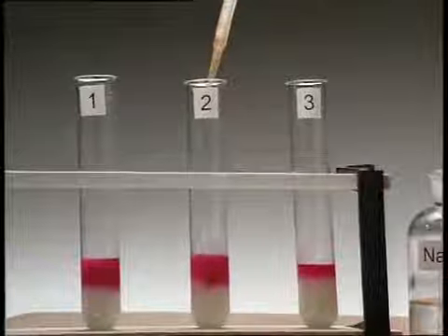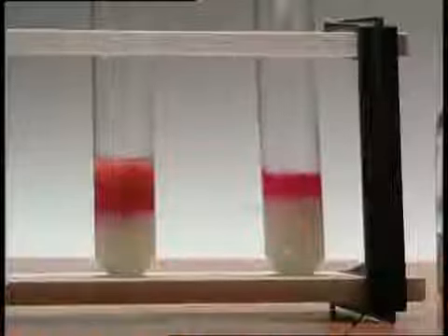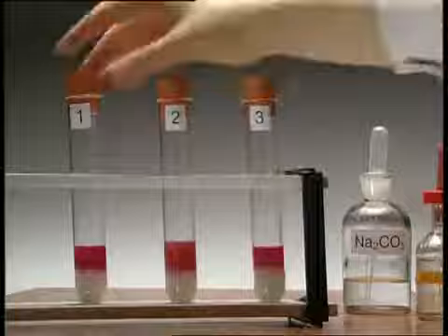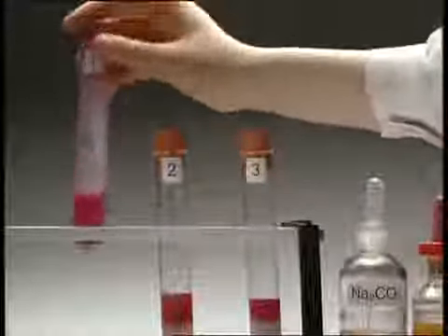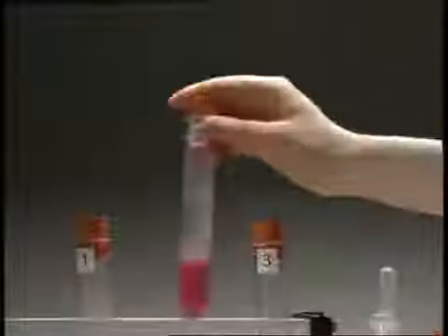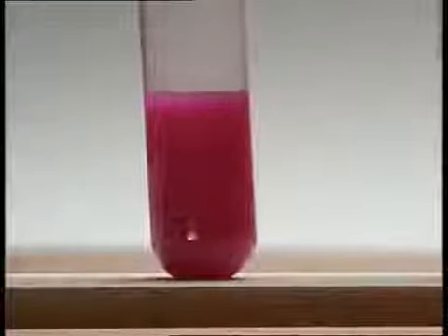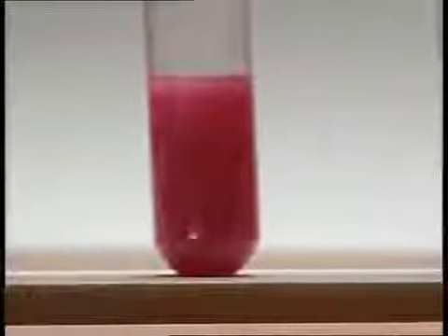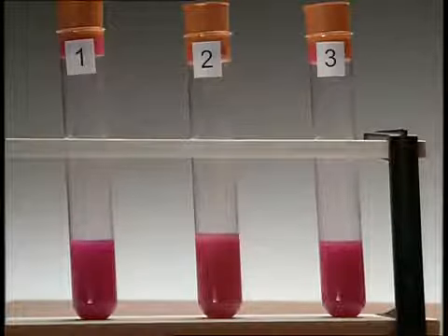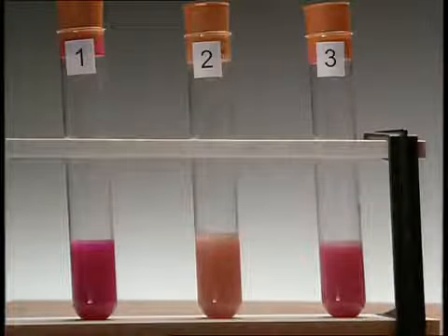Bile is added to test tubes 1 and 2. Then the same amount of lipase is added to test tubes 2 and 3. So, tube 1 contains bile salts. Tube 2 has both lipase and bile salts. Tube 3 has lipase. When fats are digested, they're broken down into glycerol and fatty acids. As the fatty acids neutralise the alkali, the pH level falls. This causes the indicator to lose its pink colour.